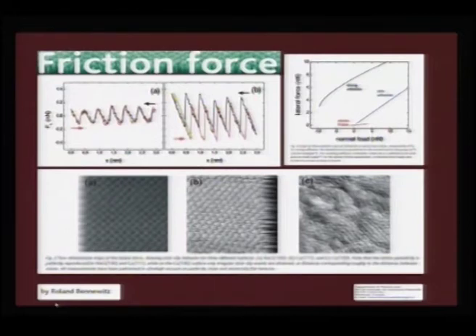We also can extend the same AFM principle to understand how the lattice arrangements are placed, and this is an improvised technique of your atomic force microscope, which is called friction microscope. If you scan through a sodium chloride lattice, you can actually see the kinetic friction is averaged out, therefore it is 0.